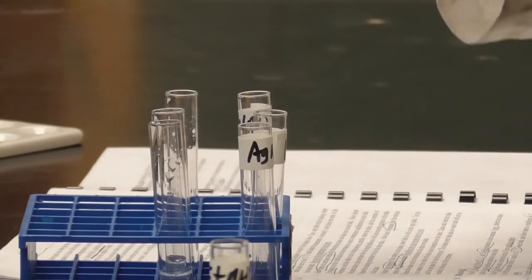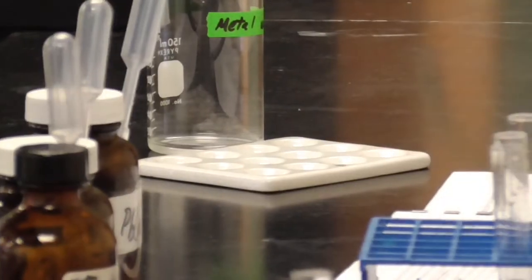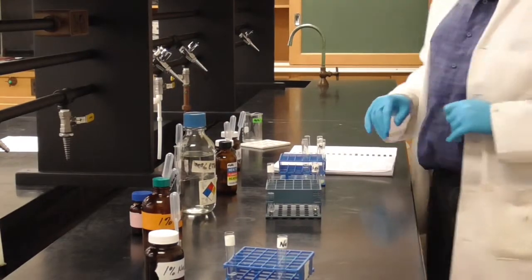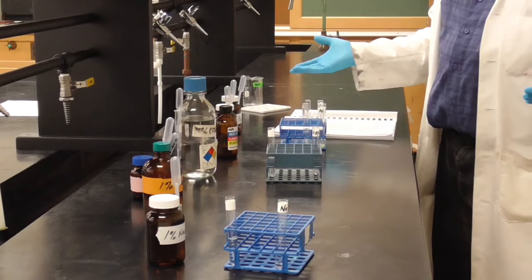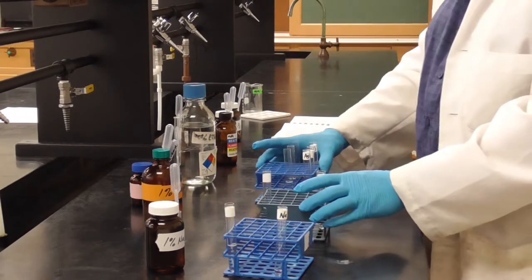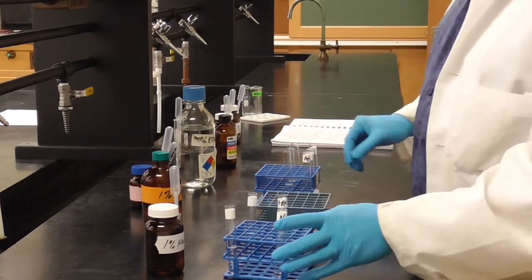Okay. So we've got in the test tubes our reagent and our enzymes with possible inhibitors. Place them all in the water bath, 37 degrees body temperature, and give them about 5 minutes to come up to temperature. So I think I'm going to just combine it like that, make it a little easier to carry it over.